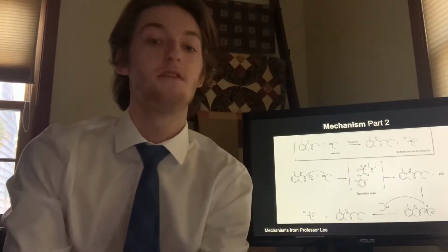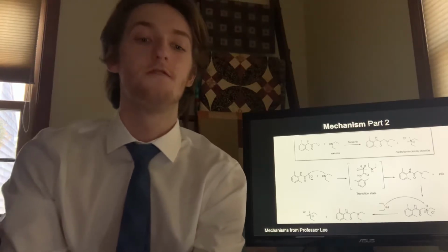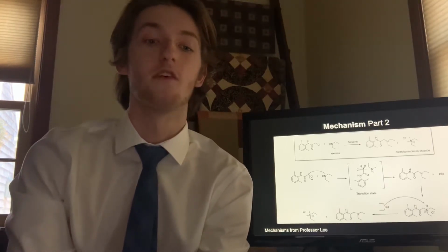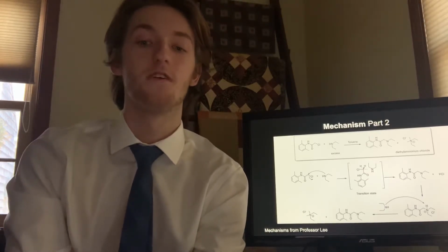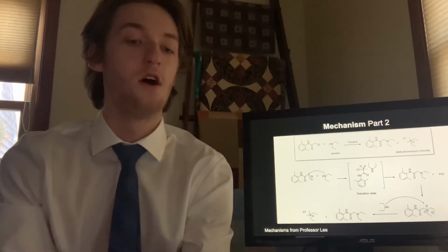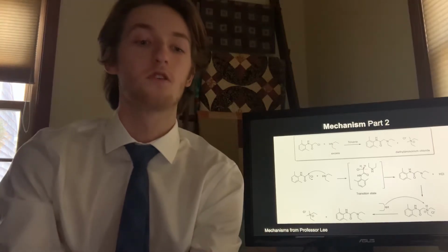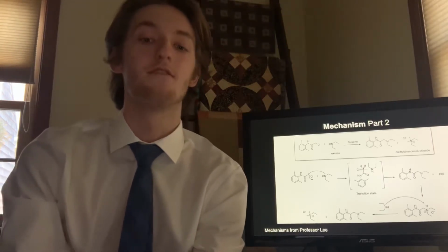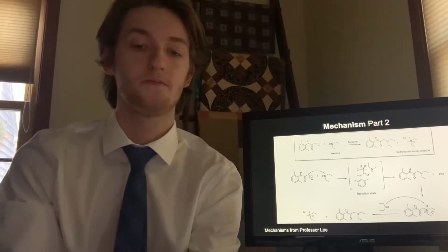The next step of the mechanism is the SN2 backside substitution reaction, where the nucleophilic and basic second-degree amine lone pair electrons from the diethylamine attack the electrophilic carbon, which is connected to the chlorine on the chloroacetamide, which puts it in the transition state in which the diethylamine and the chloride are opposite to each other to give lidocaine hydrochloride salt, which is a 3rd-degree ammonium salt.